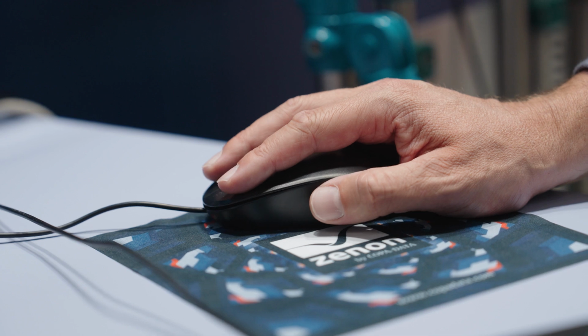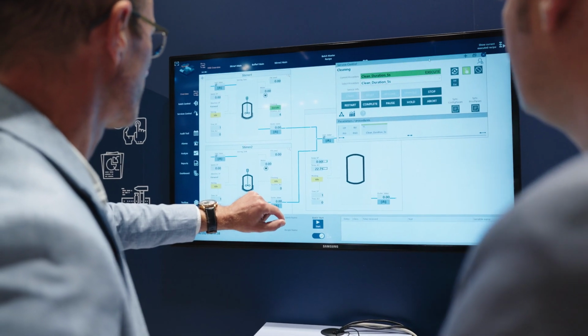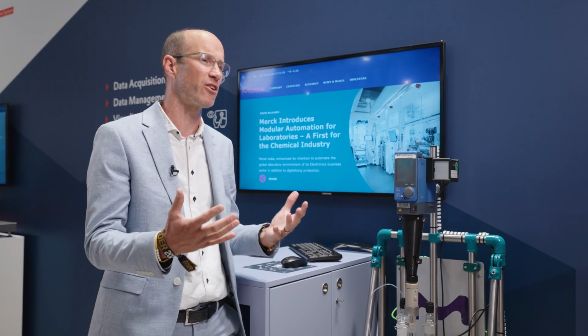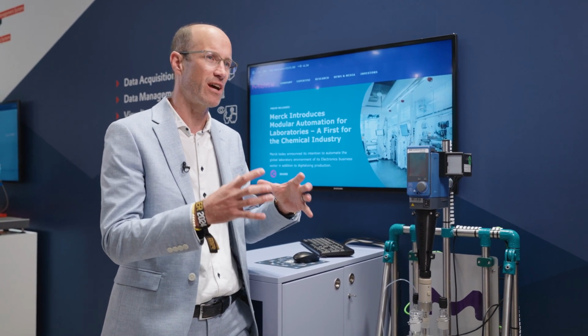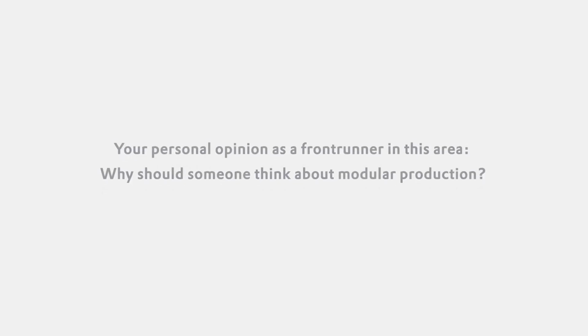The next thing is to implement a POL, because then you can start to connect, or you have standard process control systems which can already read MTP and use it. And then with these small steps you can also start to think of implementing new technologies like process analytic technologies, small modules which already come with an MTP and are easy to implement in your brownfield environment.